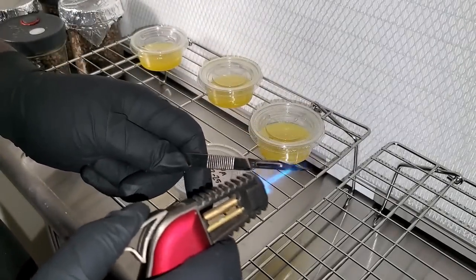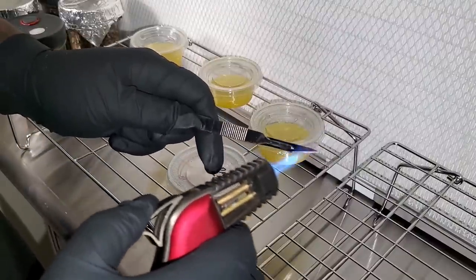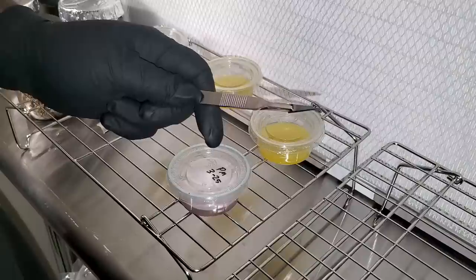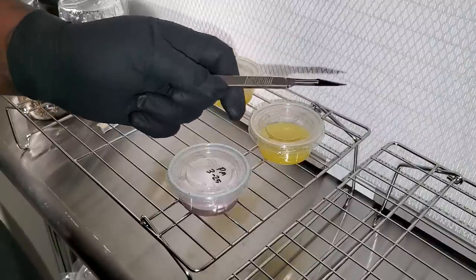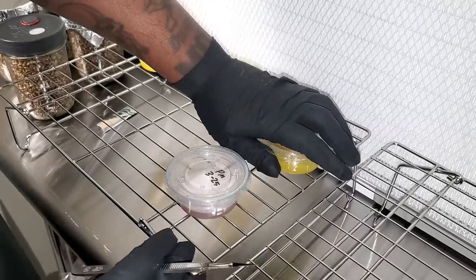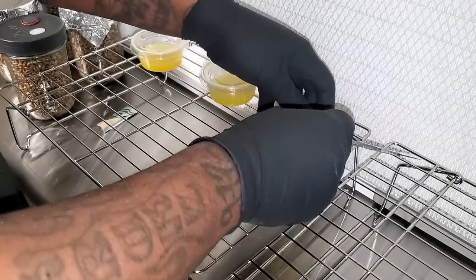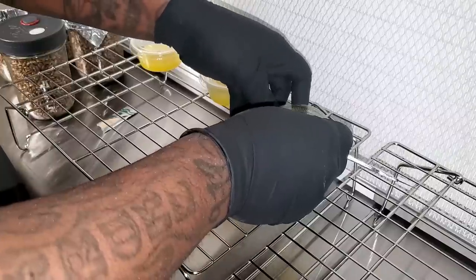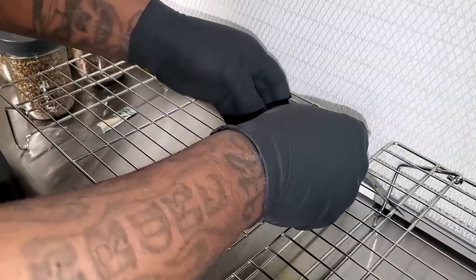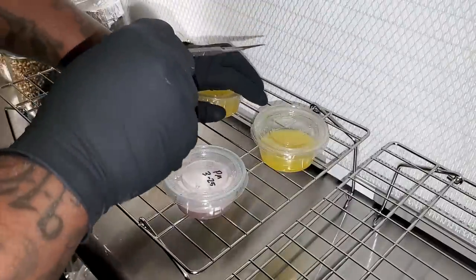The still-air box did work great for me, but it's hard to see what you're doing inside it, and it's hard to get great-looking footage — and as a content creator that's very important. What I'm doing right now is an agar-to-agar transfer. Basically I'm going to cut a small piece of agar that's already been colonized with mycelium and put it in a brand new cup of agar.